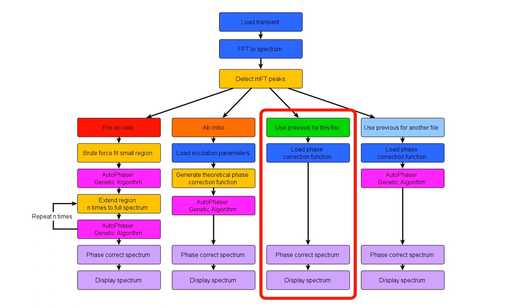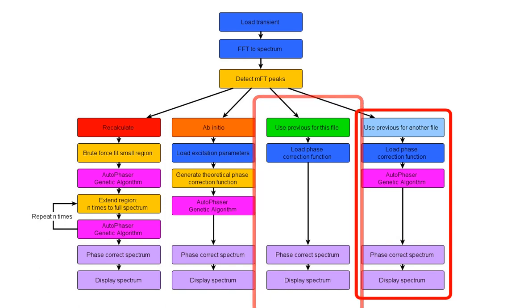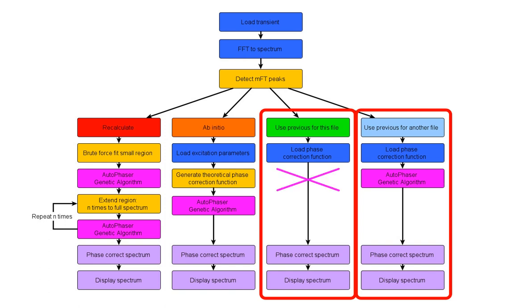You can simply ask Autovectus to reapply a previously solved phase correction function for the current file. Or, if you have several files that were recorded using the same settings, you can ask Autovectus to use the phase correction function for a similar file and optimise it for this file. The difference is that when using a previously optimised function for the same file, Autovectus knows where the file is and doesn't have to use the genetic algorithm to optimise it. However, when using a phase correction function for a different file, you need to tell Autovectus where that file is, and then the phase correction function will have to be re-optimised in case there was any space charge or other change which affected its accuracy. When we get to this step, you'll see that this is all automated.